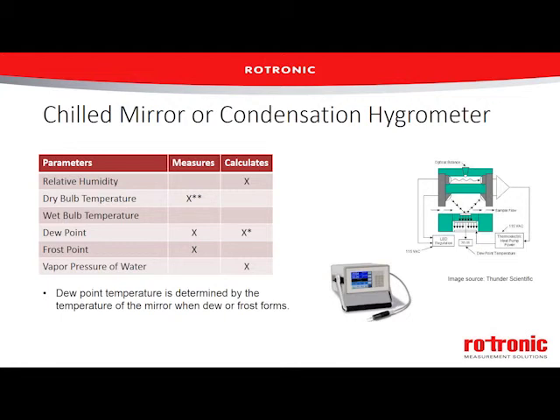This is a case where often a chilled mirror could still have liquid dew on it instead of frost. The dew point and frost point are about minus 10, minus 11 degrees Celsius, but if you don't know which one's there, you'll get about a 1% relative humidity difference. And unless you know what's on your mirror, you can't accurately calculate what your relative humidity is.